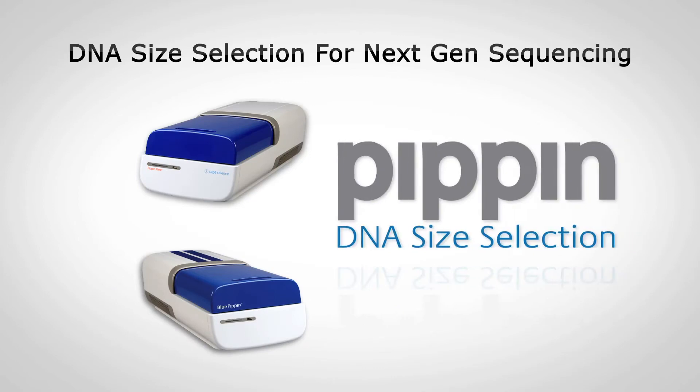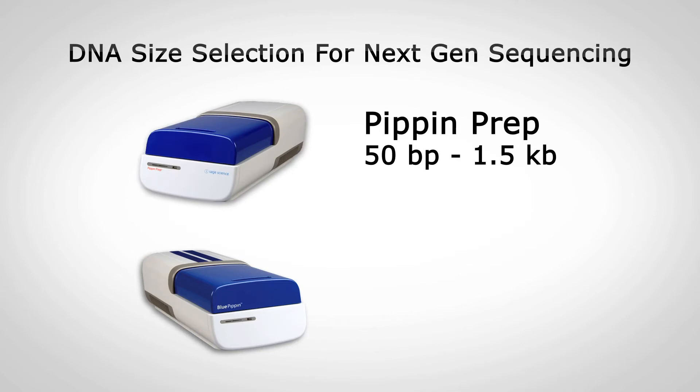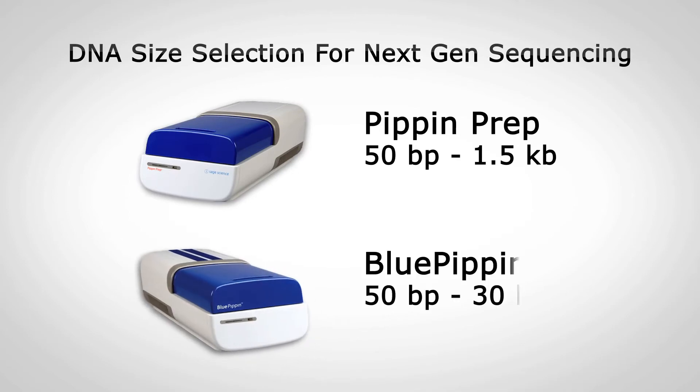The Pippin line of products automates and improves the gel purification process required by many next-gen sequencing applications. The instrument line has two models: the Pippin Prep for DNA size selections from 50 base pairs to 1.5 kB, and the Blue Pippin, featuring pulsed field power, which expands the upper limit of collection to 30 kB.